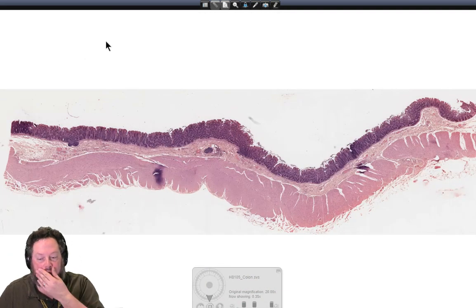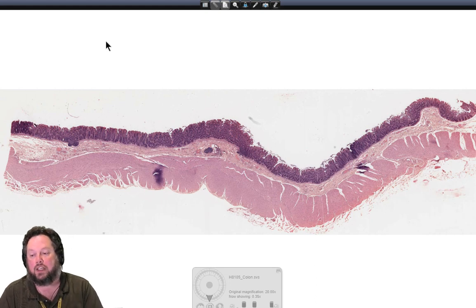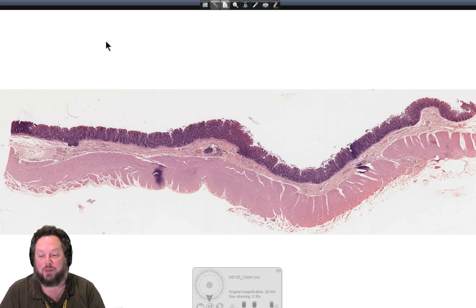So from the small intestine, we then move into the large intestine. Now, I don't have a section of the ileocolic junction. There is a valve there which regulates entry into the large intestine. Students of mine, students doing CAM 202 or students doing CAM 102 that will eventually become 202 students, don't ever expect to see an ileocolic junction in my exams.